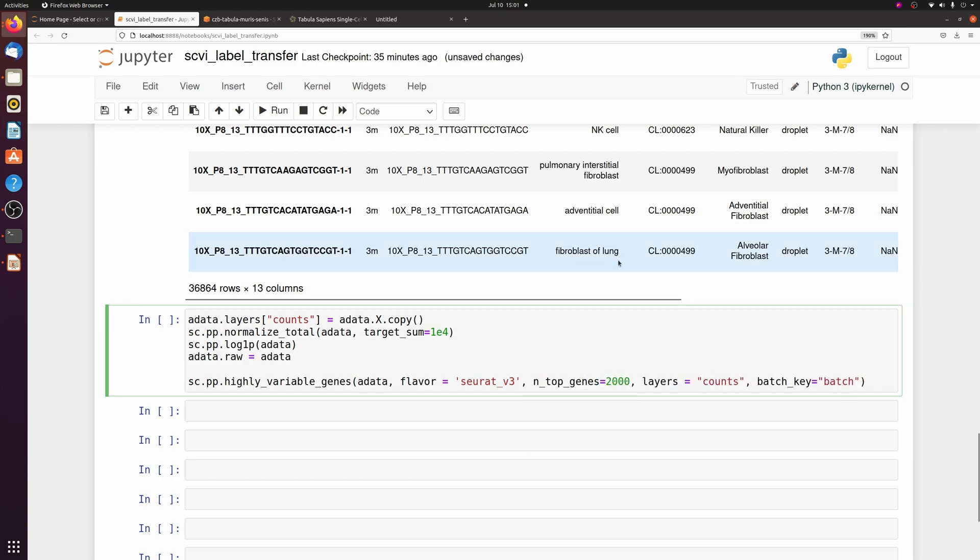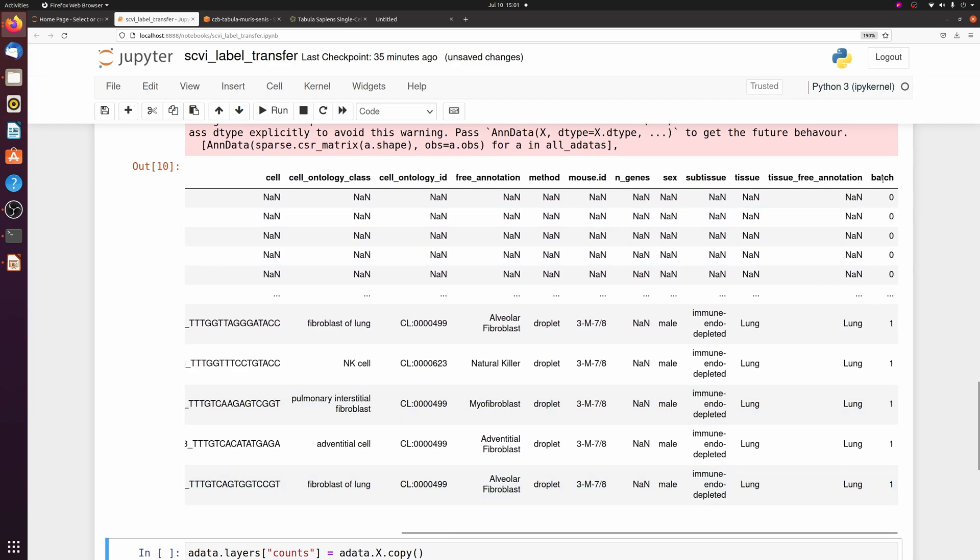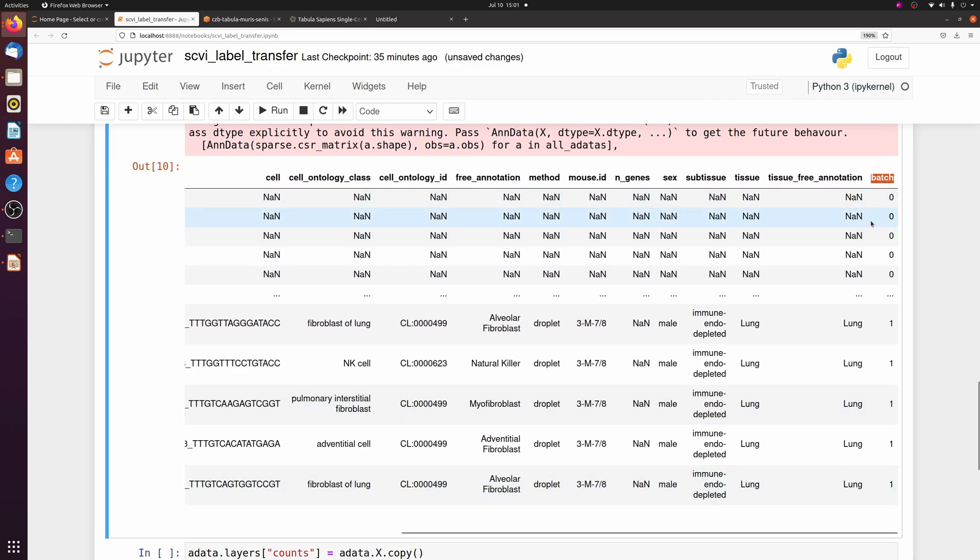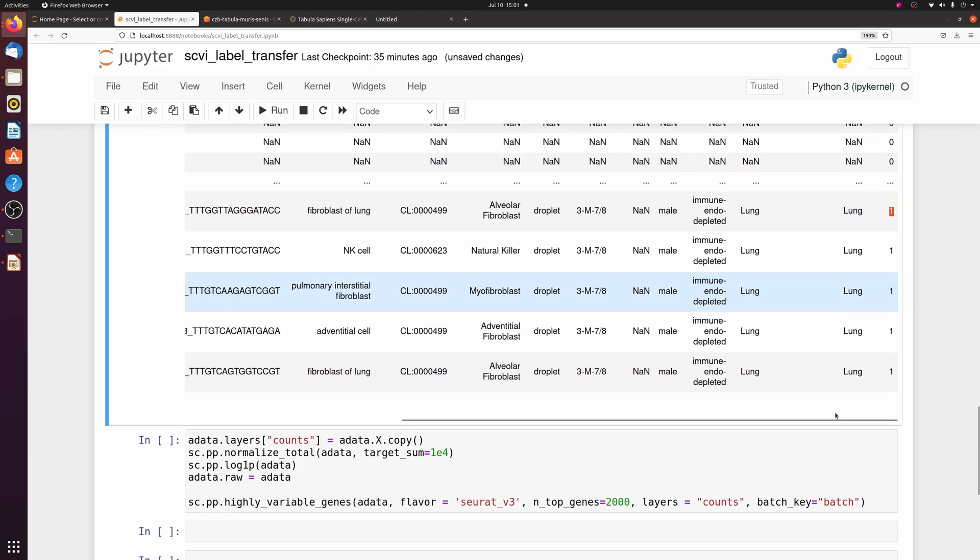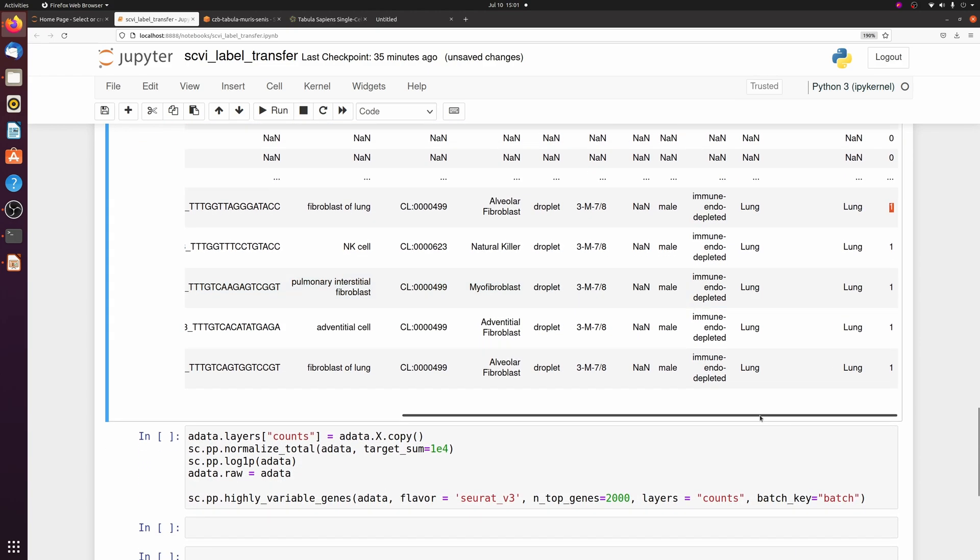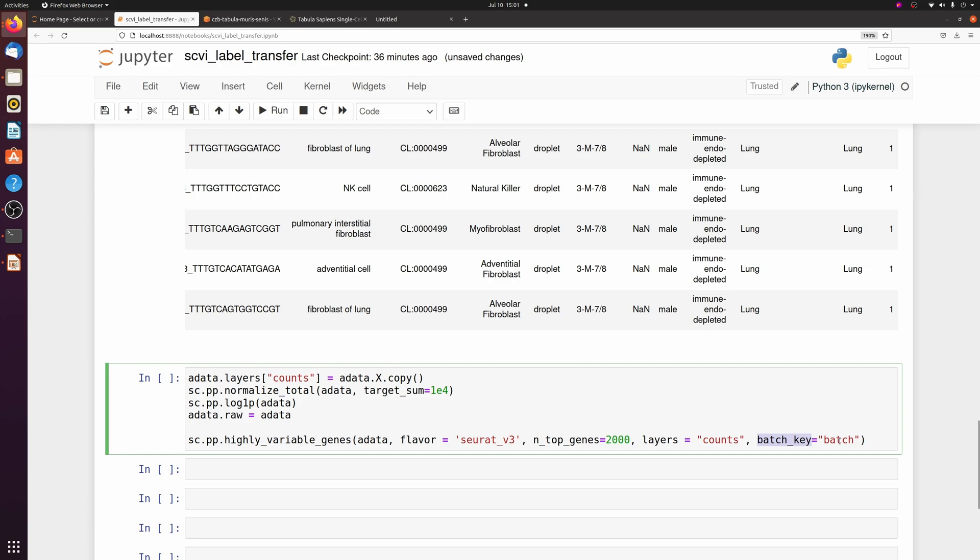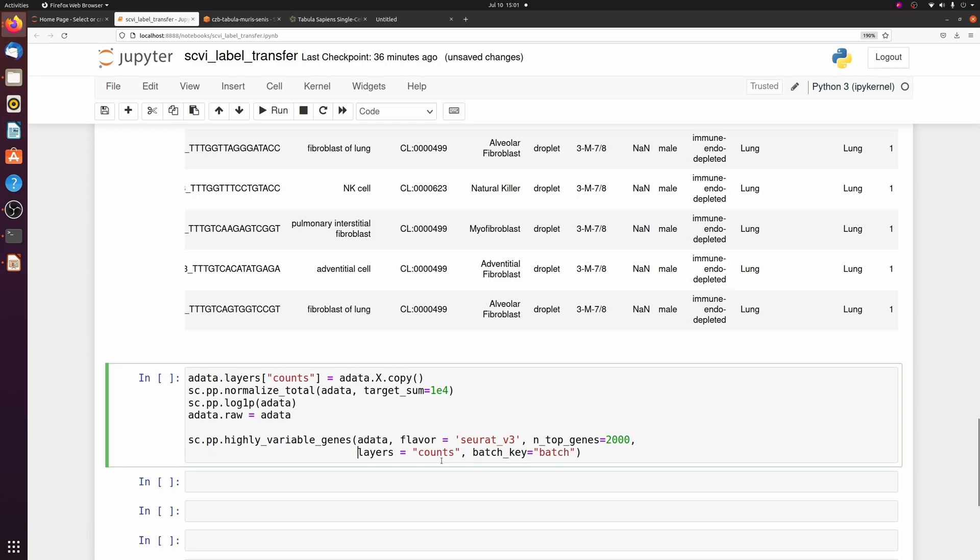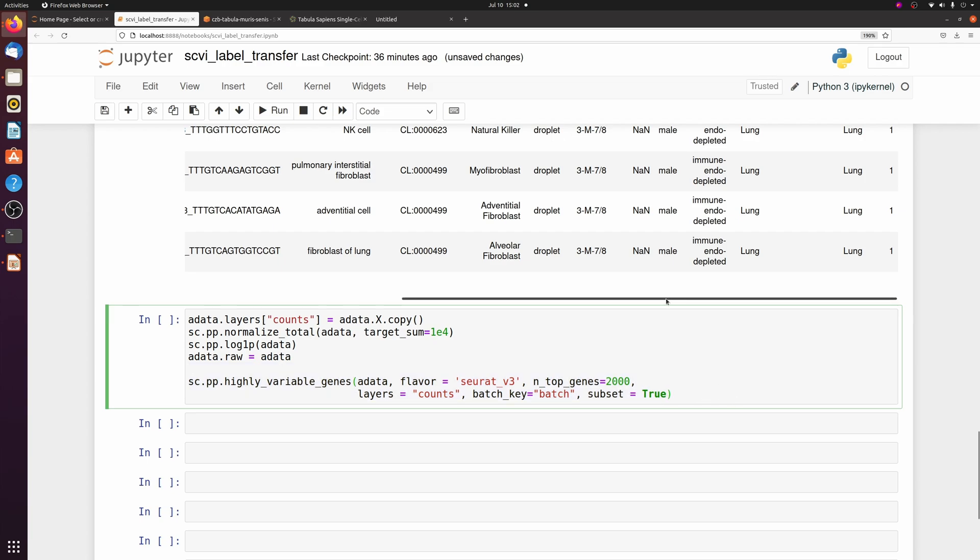So let's just set up our scvi object. I should point out that when you do the concatenate function, it adds a new batch column, so whatever you're concatenating onto will always be zero and then the rest will be added as one or higher if you have additional samples. So our batch key is just going to be the batch, which is that column name. All we're really doing here is saving a counts layer and then finding the top 2000 variable genes so that we can train the model without it taking forever.